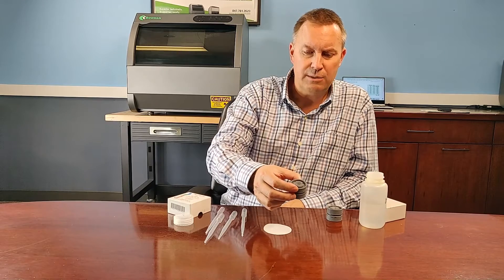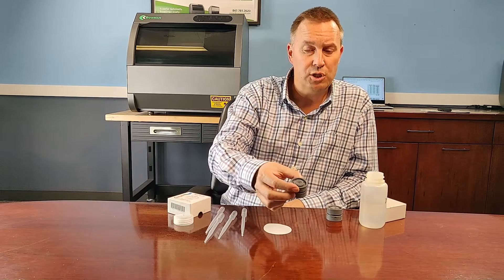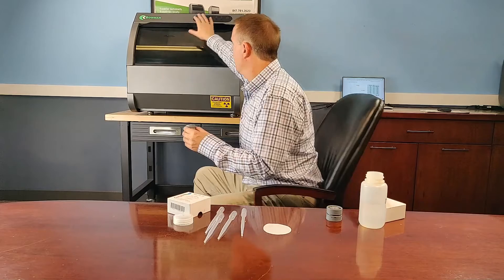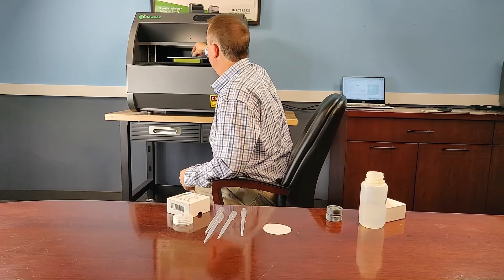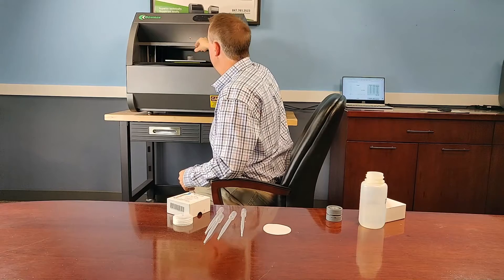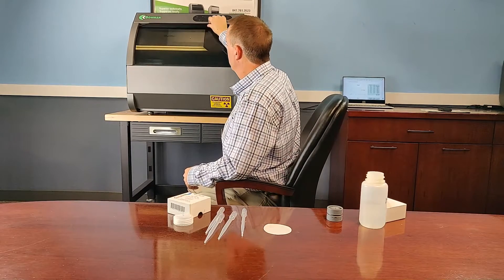The mylar protects against any spillage and it's ready to go into the machine. I have an L series here — all I do is put it right in under our door laser, close the lid, and then go into the analysis file and measure the solution. Hope this helps, thanks a lot for watching.